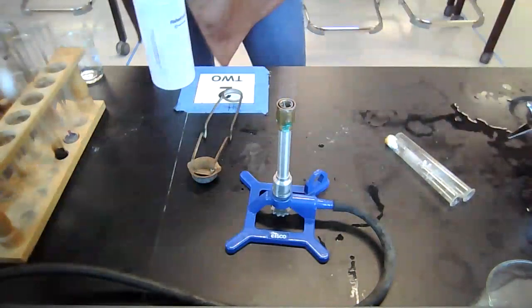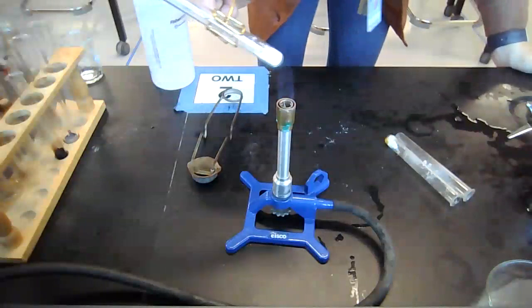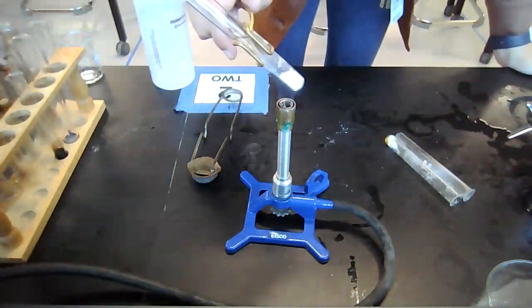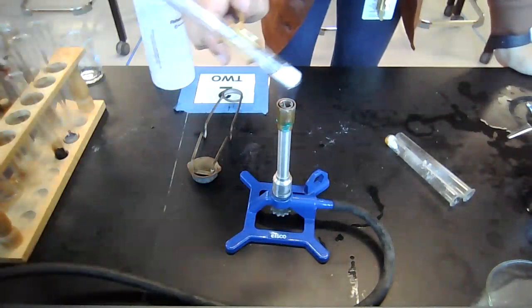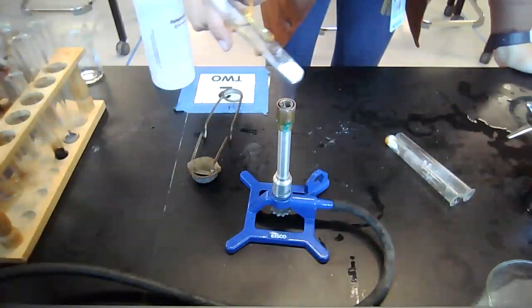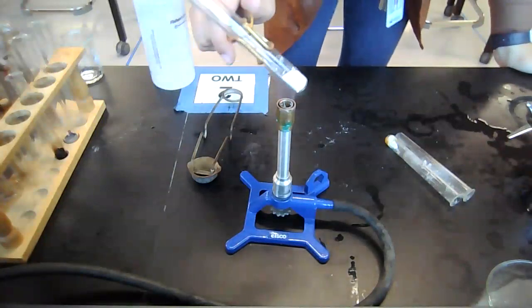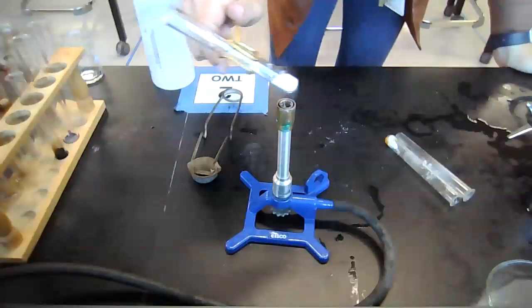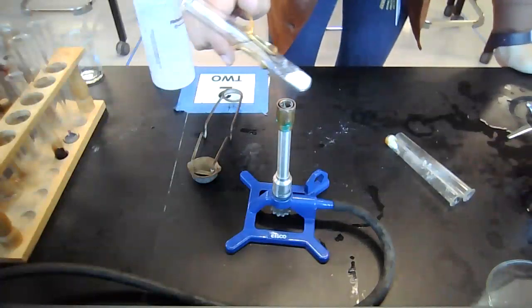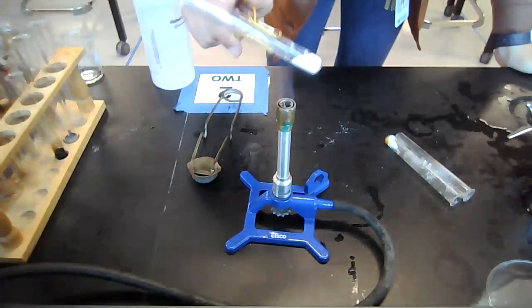And my last one is sodium chloride. I'm going to go ahead and start this now at 552. What you'll notice, this is going to take a very long time. So you can keep watching this video if you'd like. This one's going to take longer than 2 minutes. You can see that nothing's happening. The melting point for this is incredibly high, something that a Bunsen burner can't really reach in this class. So you can heat this for as long as you want, but nothing's going to happen. So if you want to record longer than 2 minutes in your data table, you're good. And that's the entire lab.